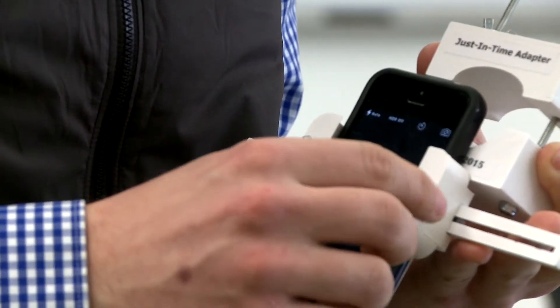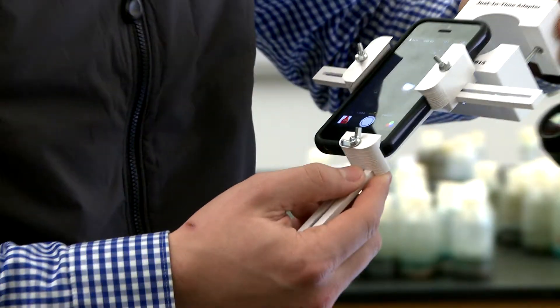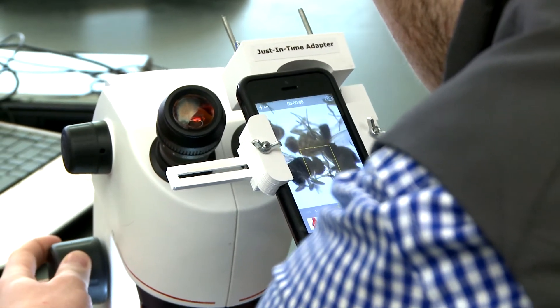So this is what he came up with: the Just-In-Time adapter. There are other adapters on the market for this, but his is original in one major way — it's universal for any phone to any microscope, and you can even fit it up to an iPad mini.